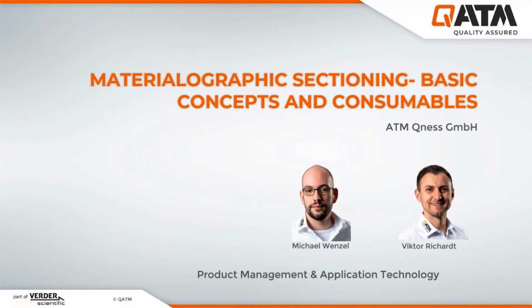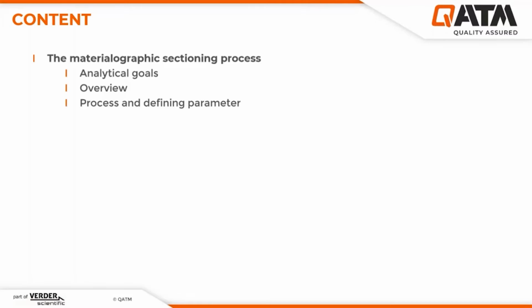My name is Michael Wenzel and I would like to talk about materialographic sectioning, the basic concepts and consumables in the following 40 to 45 minutes. We will talk about this agenda here.